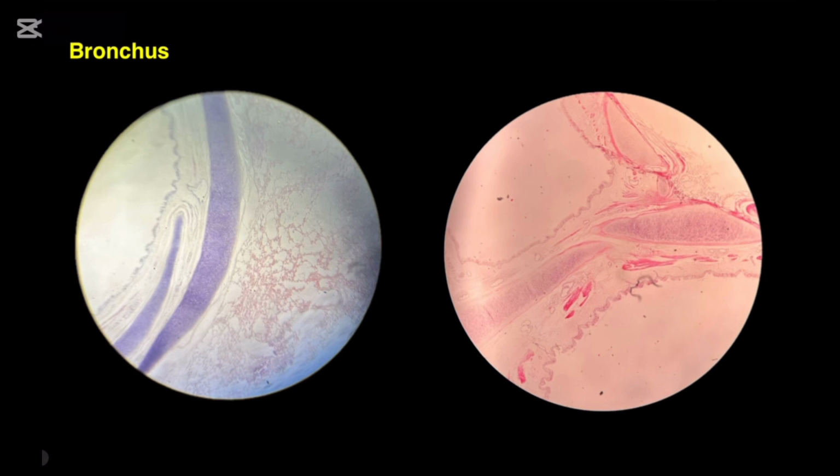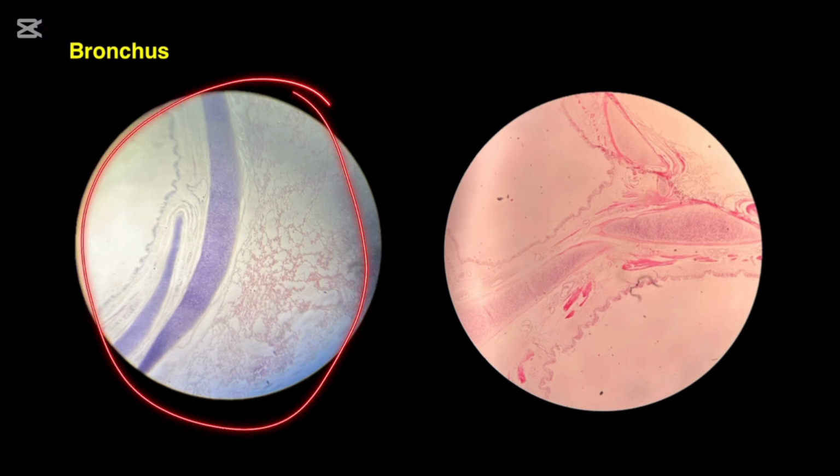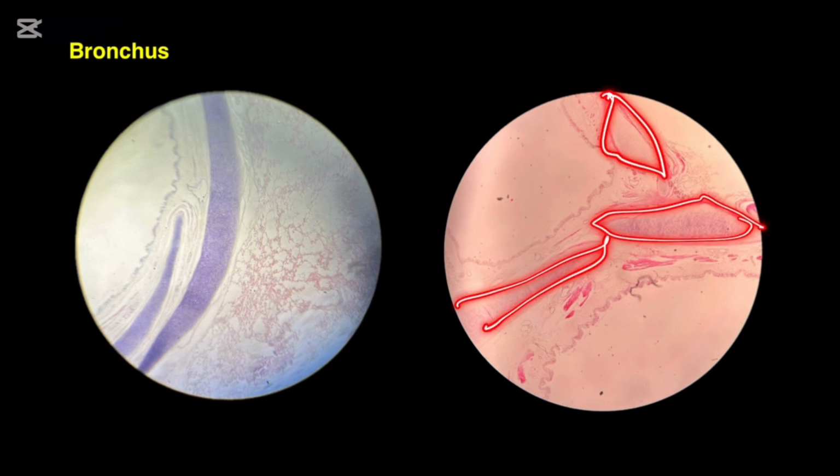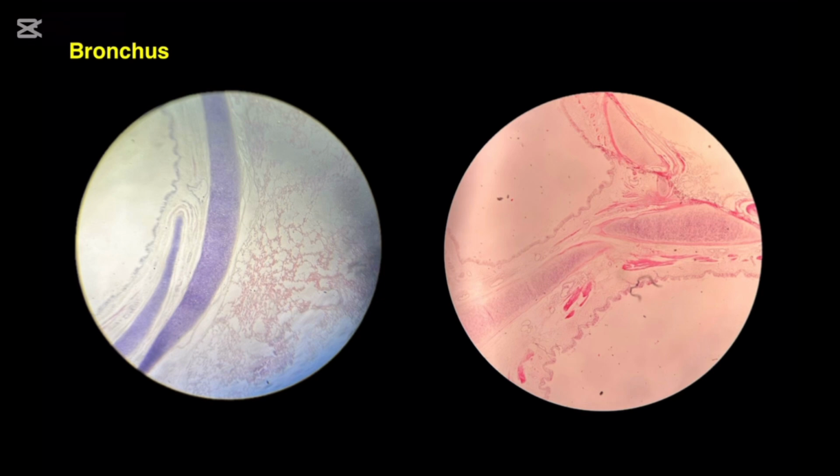Here's the histological slide. See, if such a slide is given, it's much easier to identify because there's your alveoli, and then there's your hyaline cartilage. And there's no way that this can be trachea since there's alveoli right here. So it has to be intrapulmonary bronchus. But let's say such a slide has been provided where you have absolutely no idea of presence of any alveoli. So the best distinguishing factor is look at hyaline cartilage, and if they are present in parts not connected to one another by any smooth muscle, it's intrapulmonary bronchus.